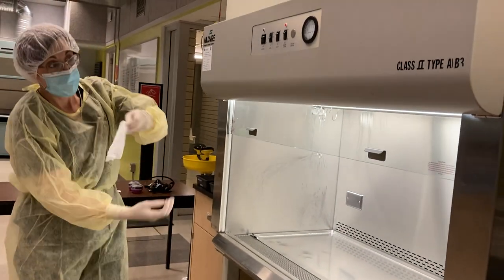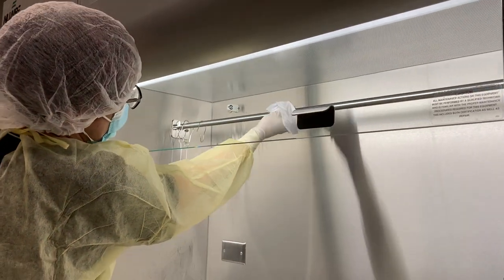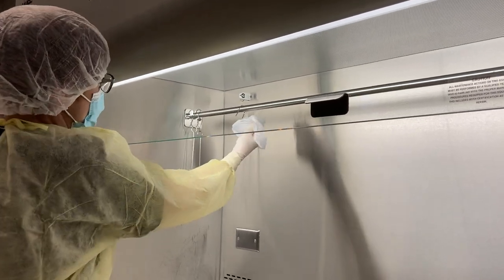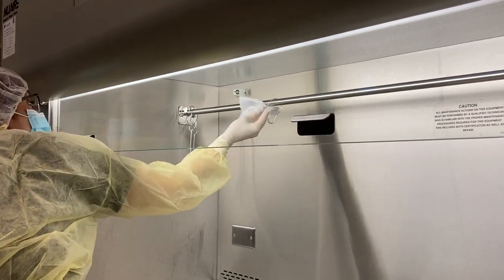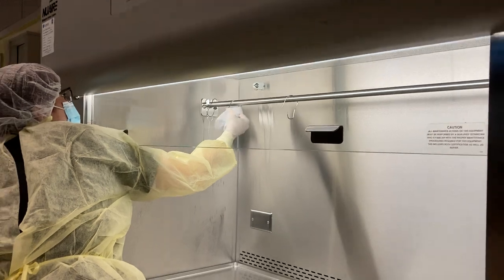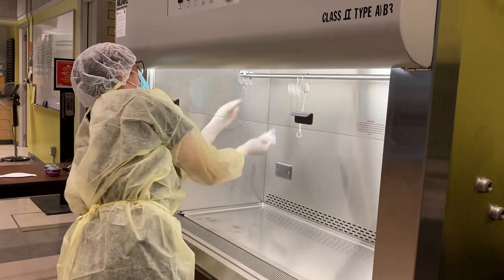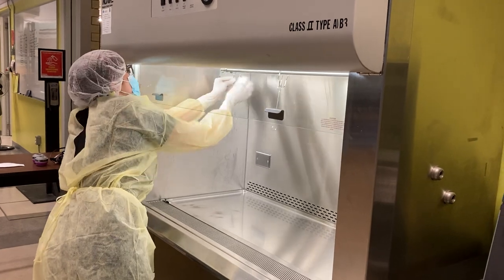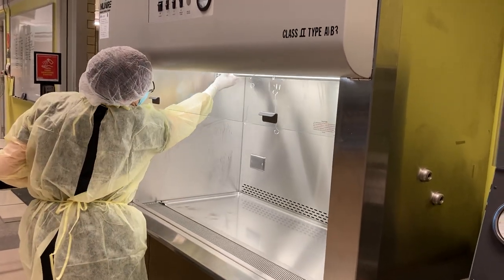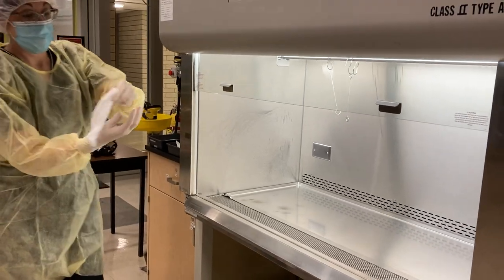Grab a new wipe, and we're going to clean the bar, as well as the hubs. Next, we're going to do the sidewalls, and this will be method B.